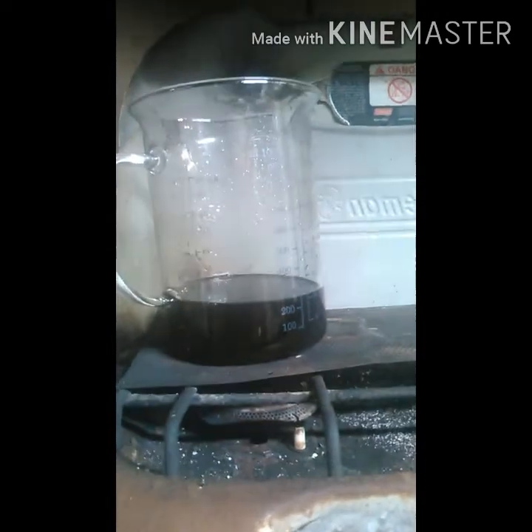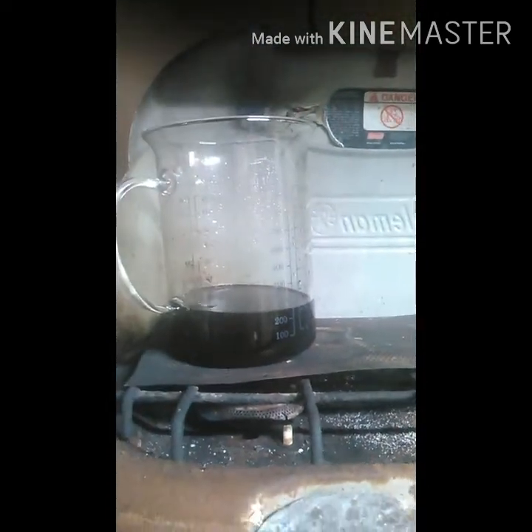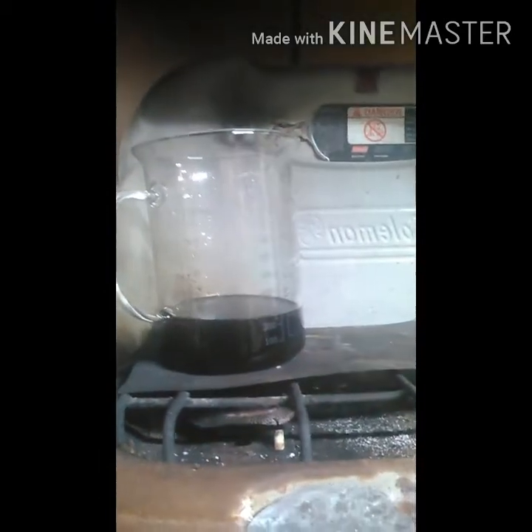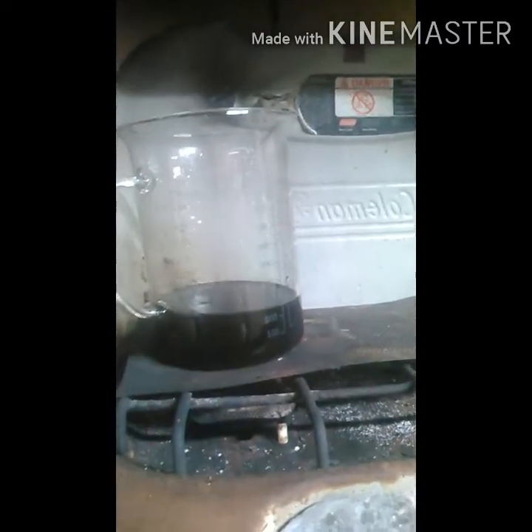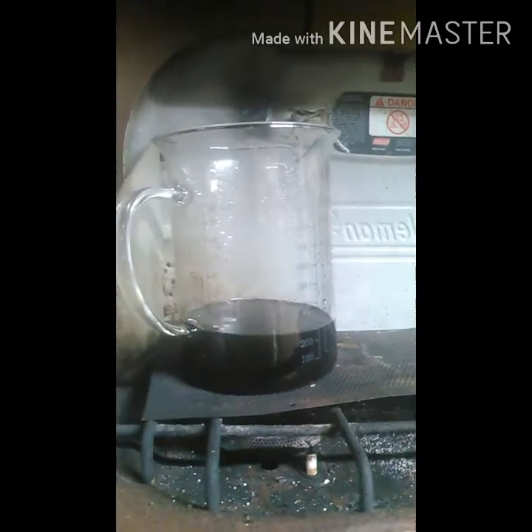I've just turned the temperature off. You can see how much water I've removed — about 250 milliliters or so. Now I'm going to let this cool and the crystals should start forming, and then I'm going to filter them.